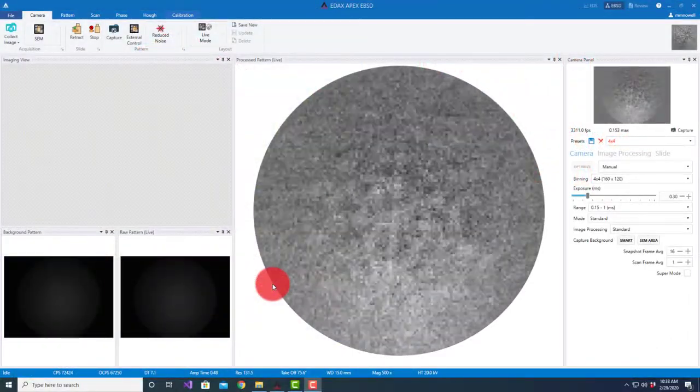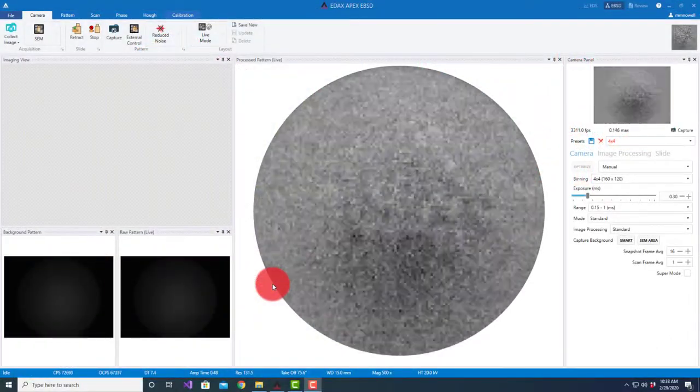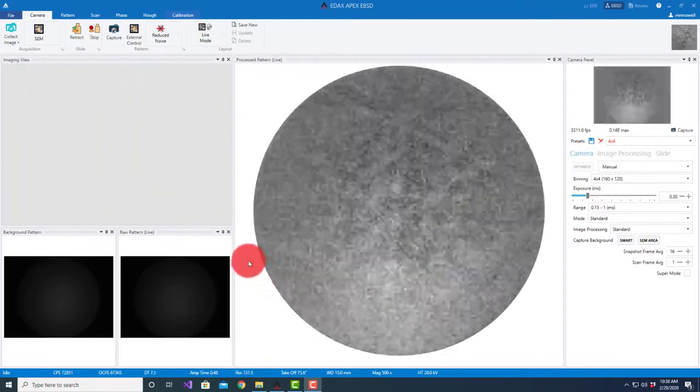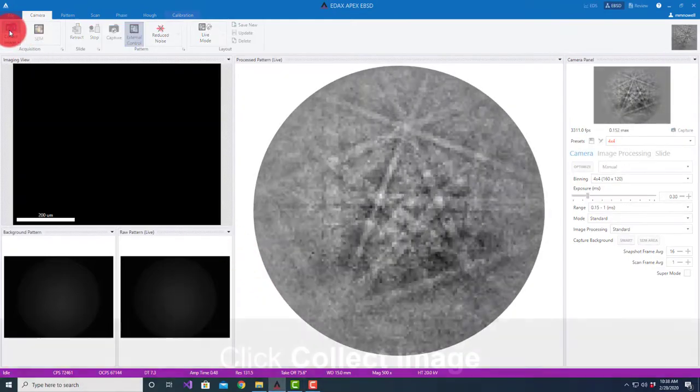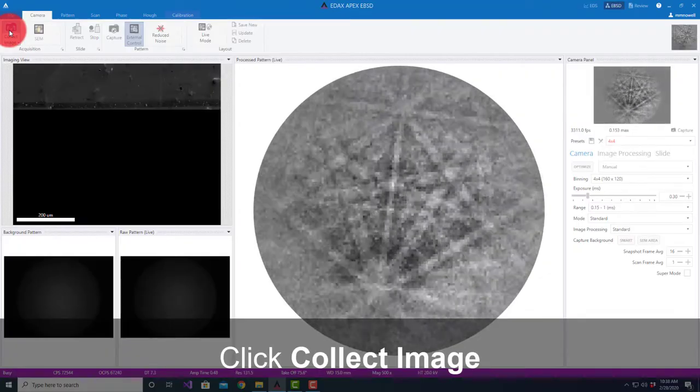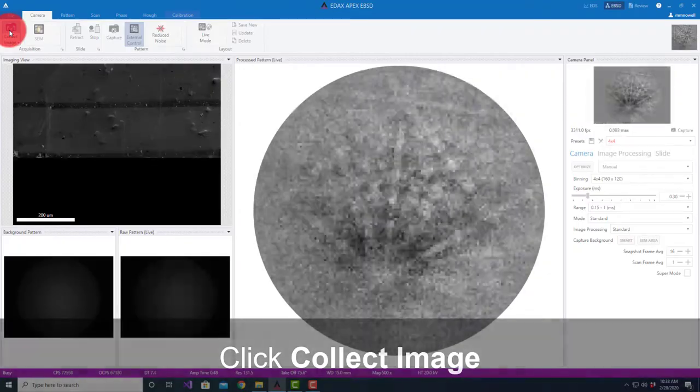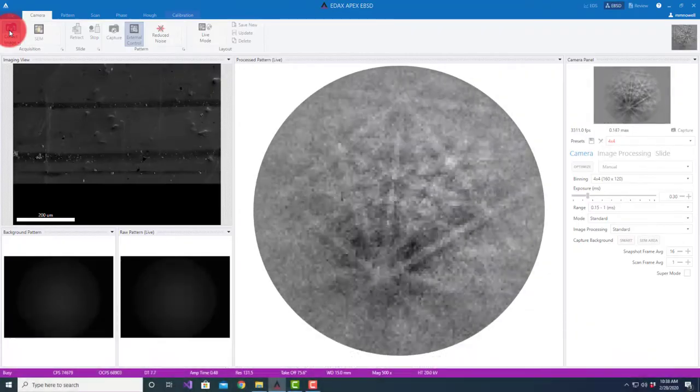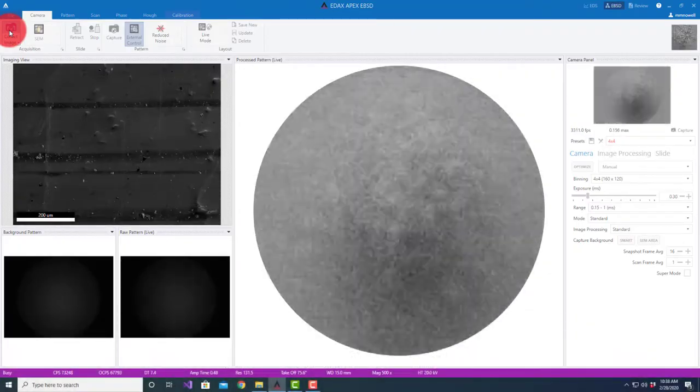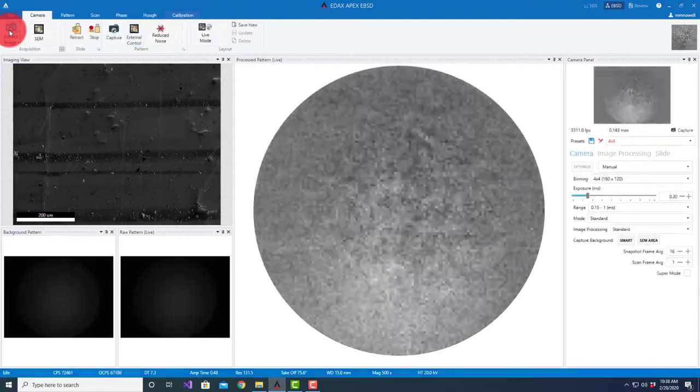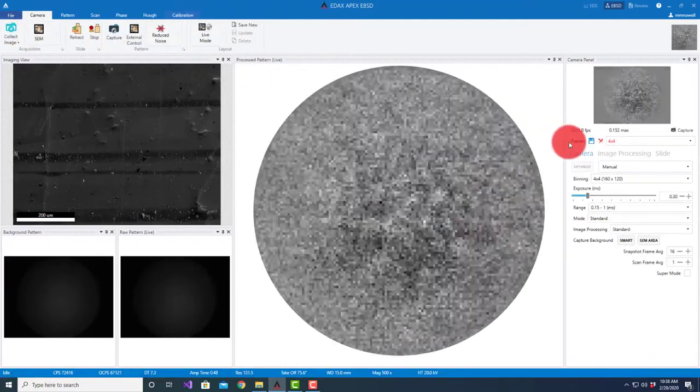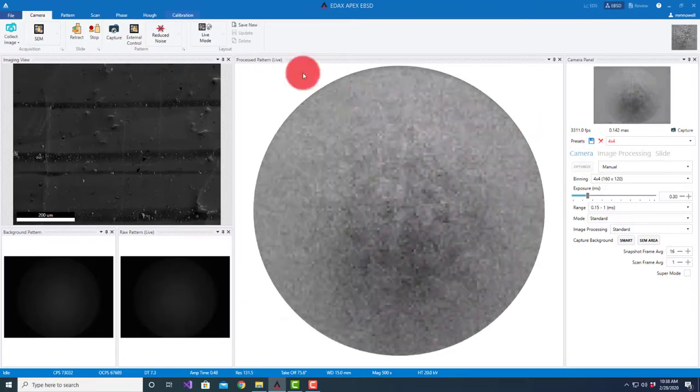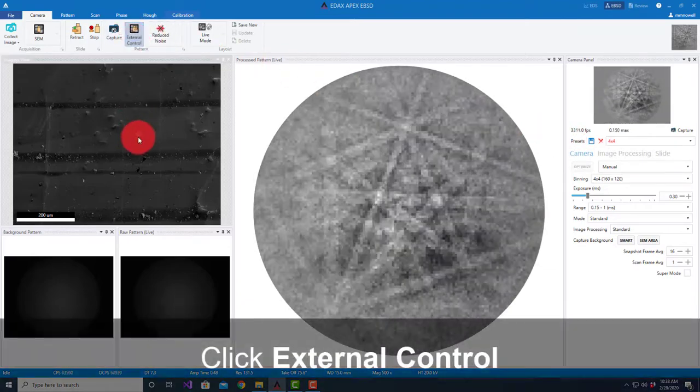This video will review the combo scan feature for Apex EBSD. I've put in an iron-based meteorite sample and I'm going to take a quick field of view image. It's a little dirty but it'll work for the video. I've set up the camera to get about 3,000 frames per second out of the camera.